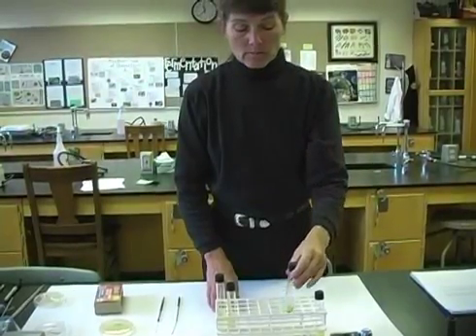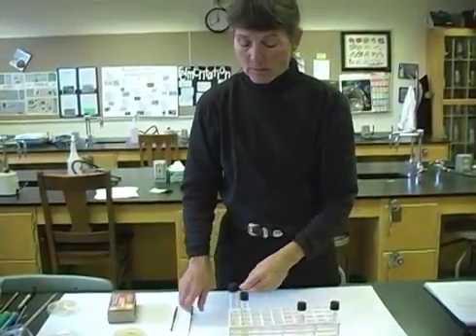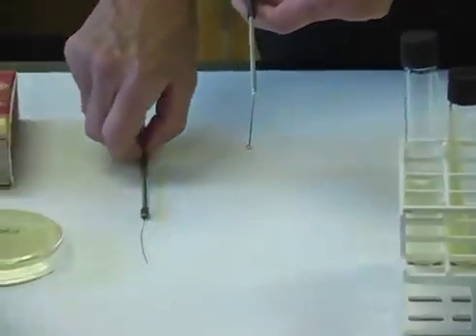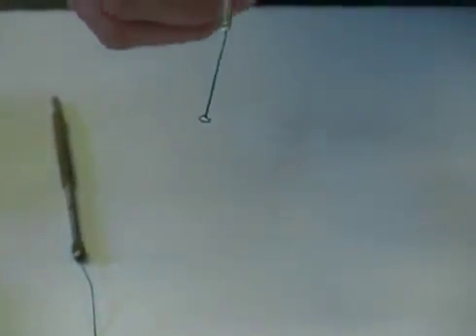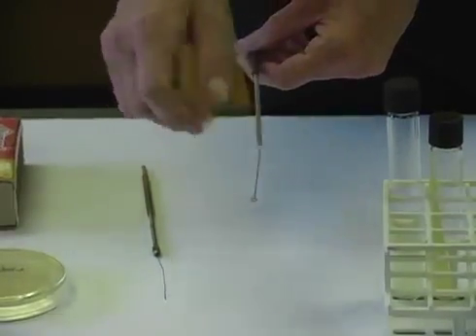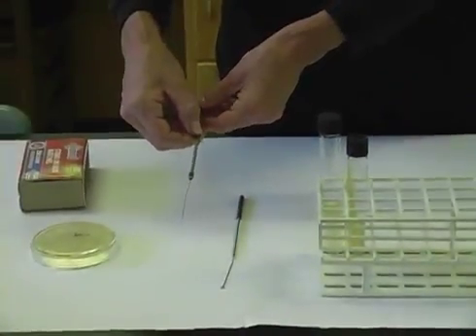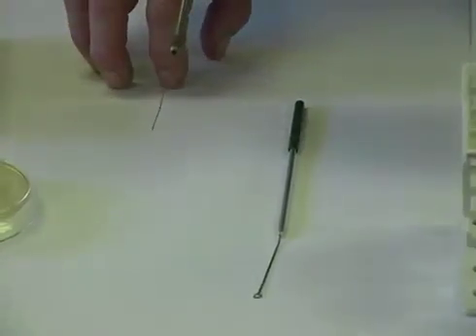To move our microbes, we will use two different inoculating instruments: an inoculating loop, which is a metal handle with a wire that's been twisted into a loop, or we may choose to use an inoculating needle. The needle is just a straight piece of wire. When we move our microbes, it's important that we don't contaminate our cultures with unwanted environmental microbes. The techniques we use to prevent this are described as aseptic or sterile techniques.